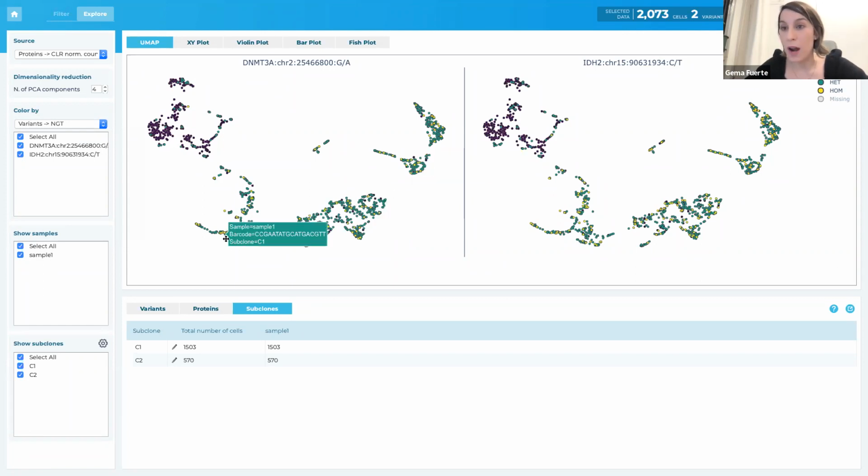the majority of the wild type cells do cluster with subclone 2, and the majority of the mutant cells cluster in subclone 1. So again, you can see that for subclone 1, there seemed to be additional heterogeneity, right? We can see that it is not a nice, huge block. There seem to be 3 subpopulations, right?